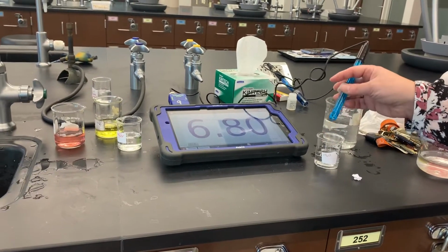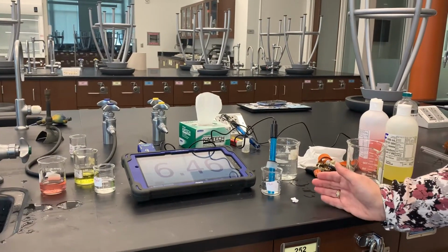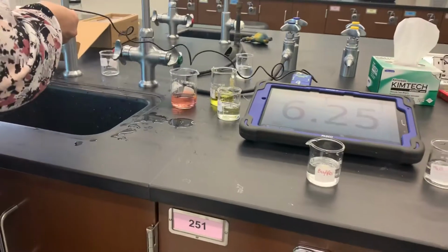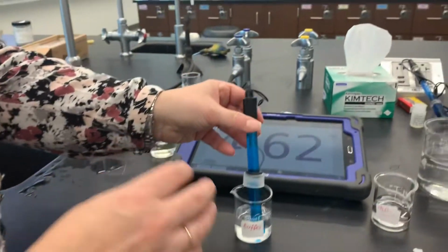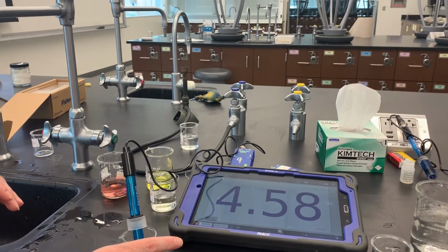So this time we're going to take a look at what happens in the buffer and water when we add strong base to it. So once again, this is my water to start, about 6.7 or so, although now it's for some reason reading lower. But in this beaker here I have my original buffer, my other half of the buffer. So I'm going to use the electrode. And remember, the expected pH of that buffer was 4.75, and we once again are seeing 4.59 and 4.6, so fairly close to the expected value.